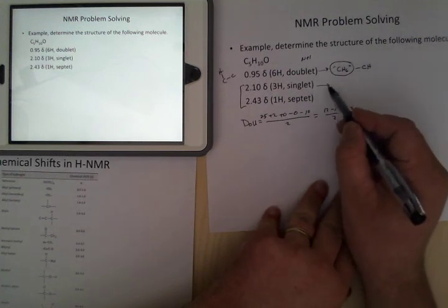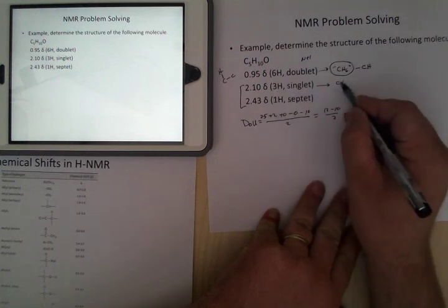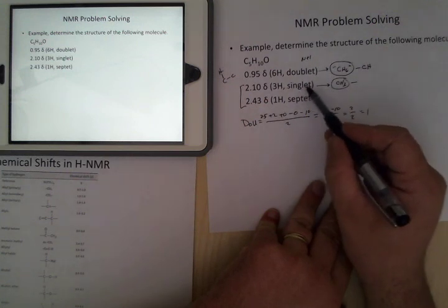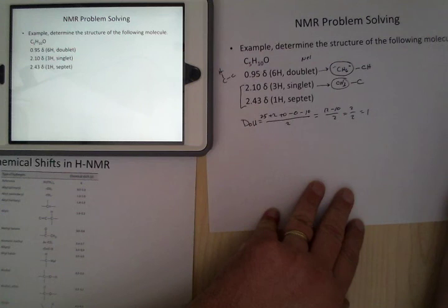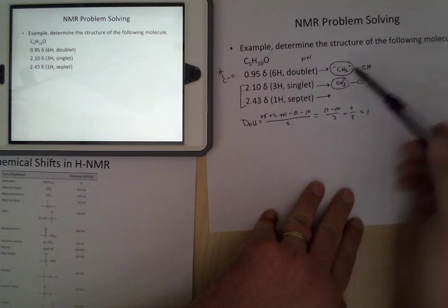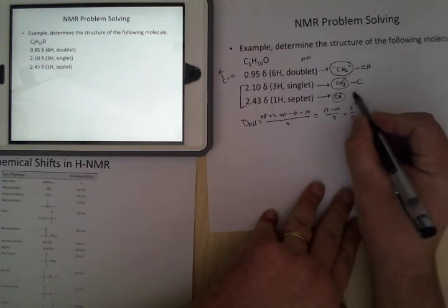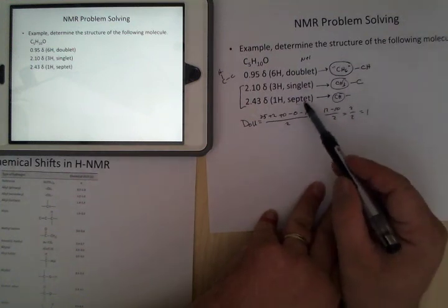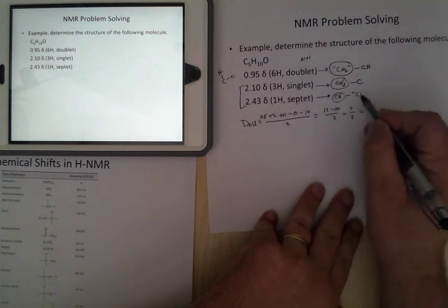This one here, we have 3 hydrogens, so it's a CH3. What's next to it? n+1 equals a singlet, which is 1, so n has to be nothing. You can't have any hydrogens on it. And then this guy here is a CH, but it's a septet, so n+1 equals 7, which means n is equal to this mythical CH6.